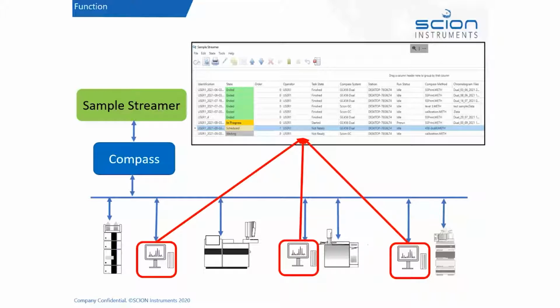So it provides all of that in one single screen, and allows you to schedule samples, that allows you to see what instruments are really busy, maybe so that you can distribute samples through to other systems in the laboratory, or maybe it helps you make the case to buy a second instrument if you can see that this instrument is always busy and always backed up with samples. That could be a cue that, yeah, having a second one of those could definitely help us and increase our revenue for our sample throughput.